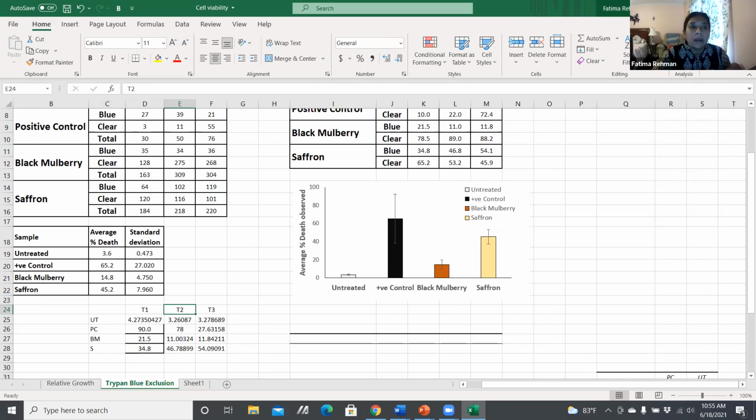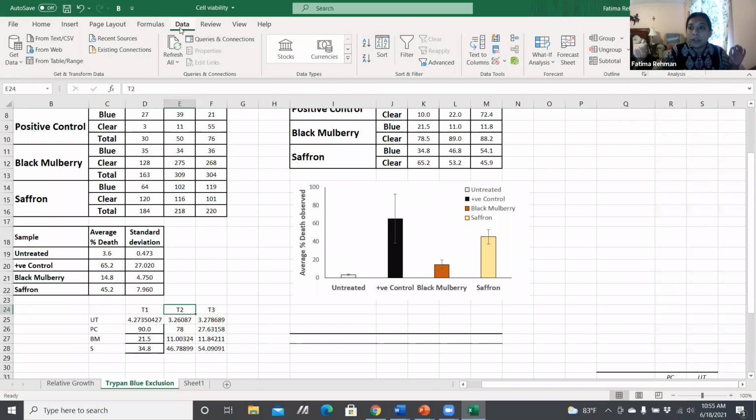1, 2, and 3. The second thing you need to have is this Data Analysis icon in your Excel sheet. So if you do not see that, if you go into the Data tab, look for this Data Analysis icon. If you don't have this particular icon, you need to get that as an add-in, which you can easily do, and I'll walk you through that.